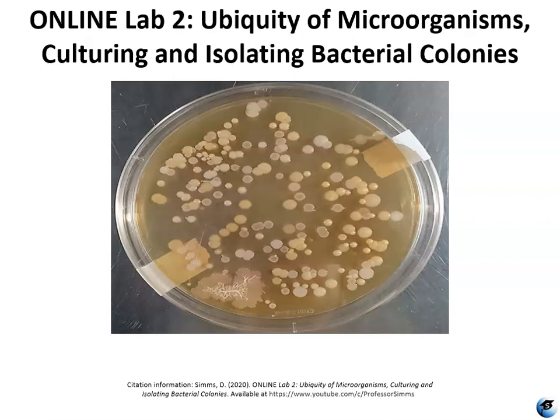Hello, I'm Professor Sims, and in this video I will discuss ubiquity of microorganisms, culturing and isolating bacterial microbial colonies. This is the second in the series of 10 lab sessions held as part of my online Laboratory for the Fundamentals of Microbiology course. If you are a student currently enrolled in this course, please consult the syllabus and course Moodle site for assignments, quizzes, due dates, and other course information.